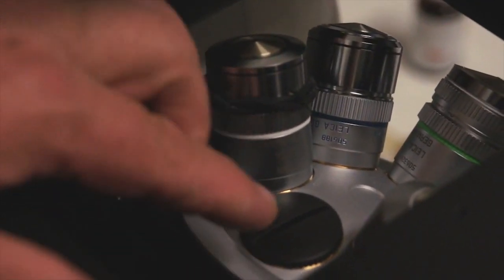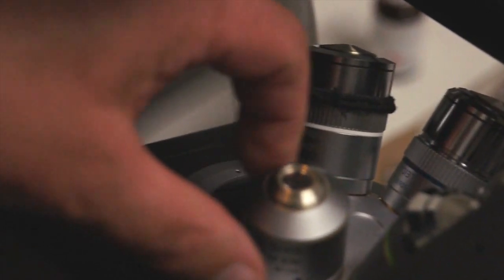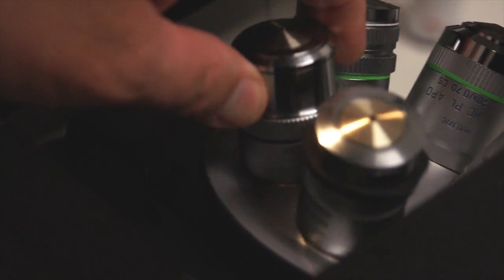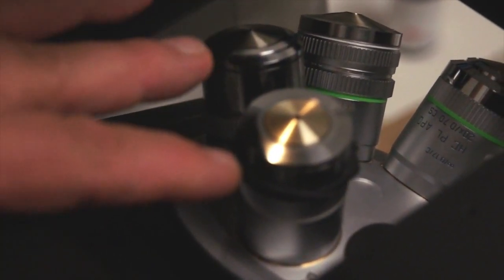Below the stage is the nose piece which holds all of the objectives. And you can see that there are quite a few objectives on this nose piece. This is a motorized nose piece but we will be manipulating it manually to choose the different objectives that we work with.